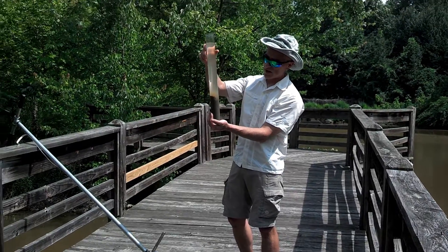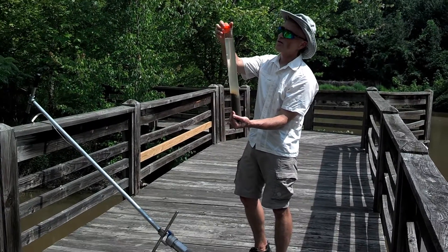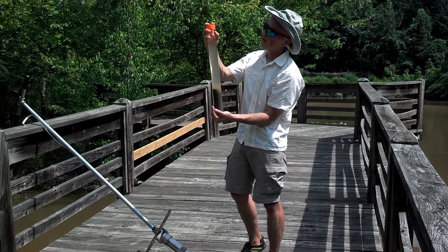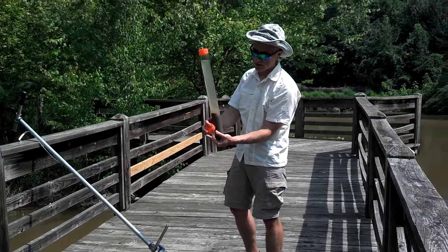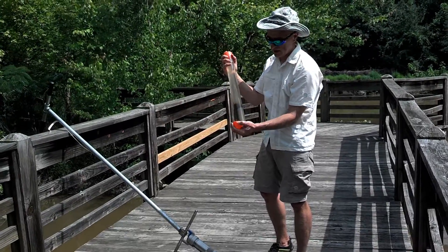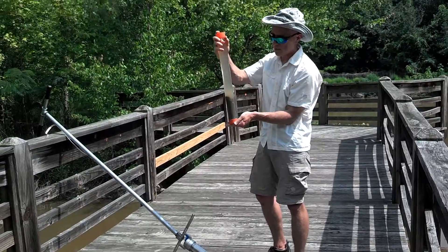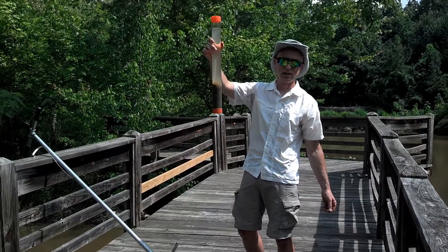Here's the sediment that was taken from the bottom of the lake. The next step is to cap the corer. Starting at the top, while my hand is still on the bottom, I'm going to place one of these caps on the corer. And I'll put another one on the bottom side. Keeping the corer oriented upright, I have a sediment core preserved from the bottom of the lake.